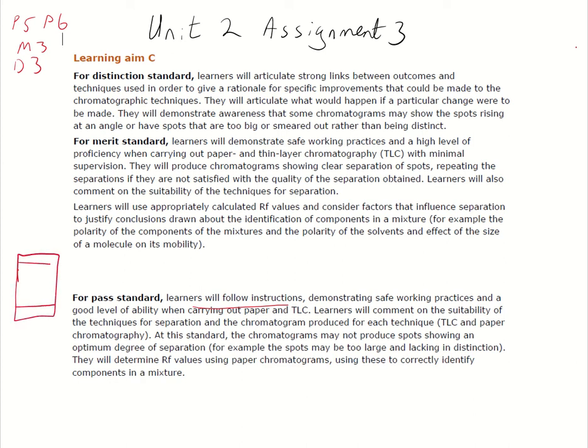something that looks like this. So obviously the unknown would compare with 2 of these 3, depending upon how you've set it up. But we should have our standards there for the paper one. Then the unknown contains 2 of those 3.